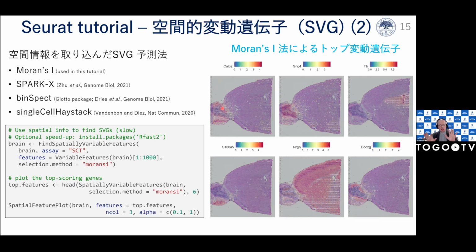So in other words, are they correlated with each other? In this case, the spots with low values are not shown here, but there are many low value spots, and they are next to each other. And the high value spots are also almost next to each other. So I guess it has a high autocorrelation. I think it's using the whole slide. Maybe that means global Moran's I, but I'm not so sure.